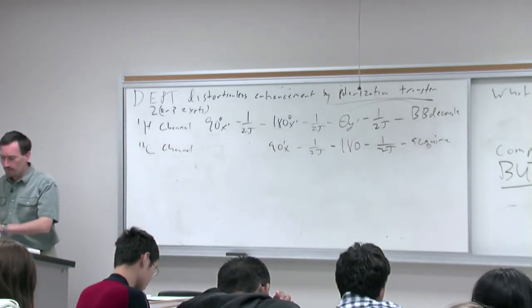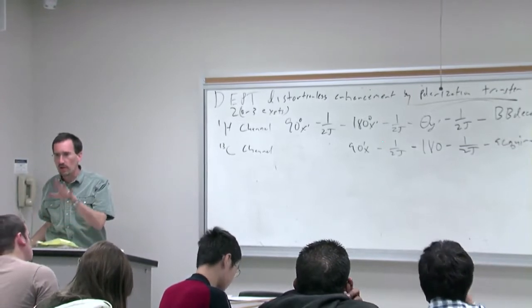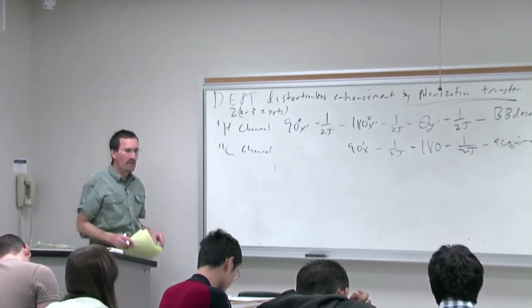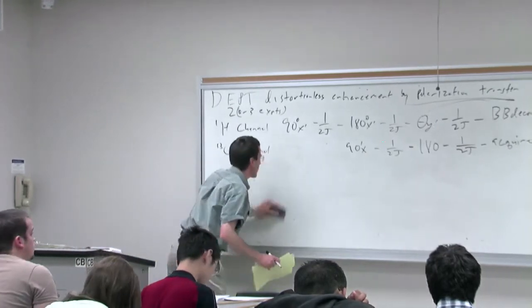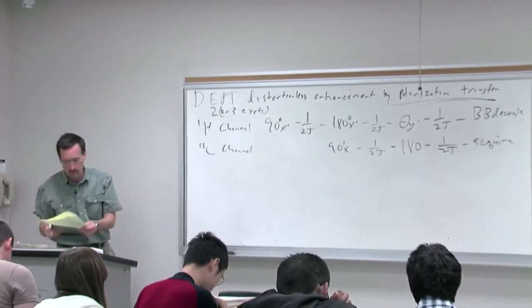And this sequence of pulses leads to both the polarization transfer, and it's also going to lead to differentiation of our methynes, methylenes, and methyl groups.